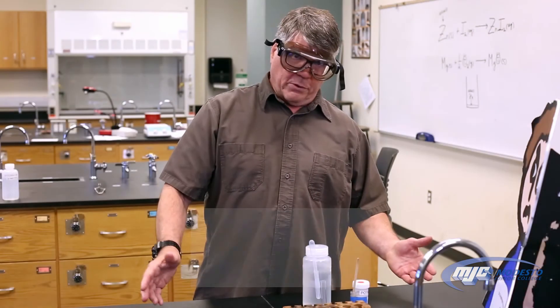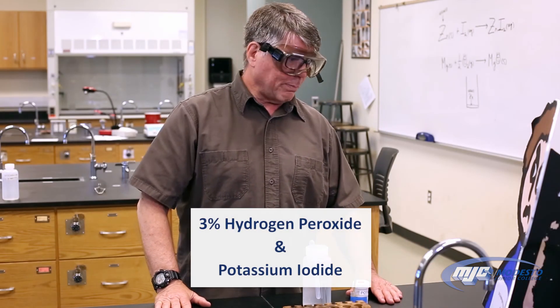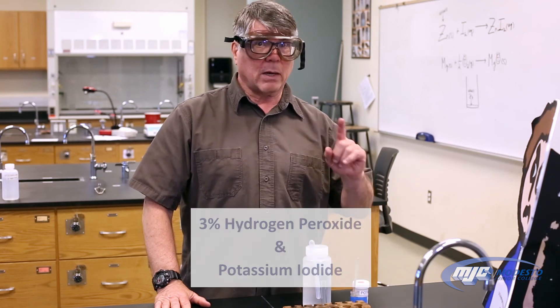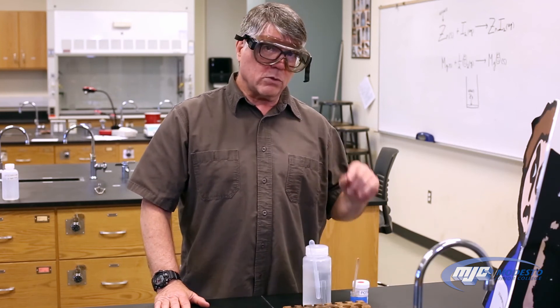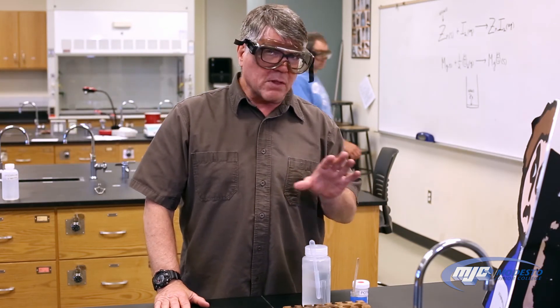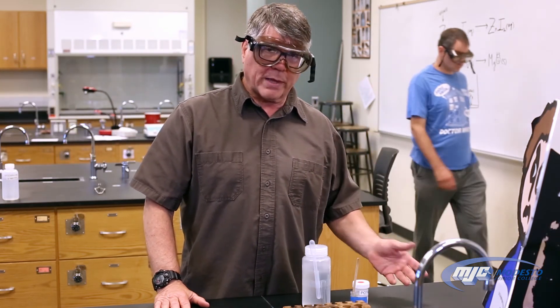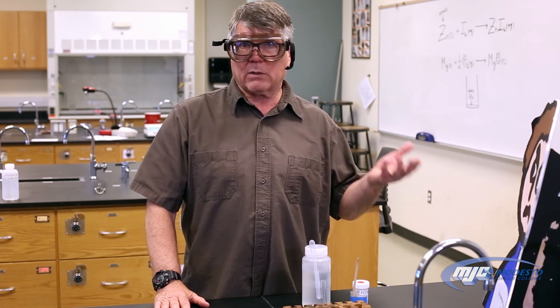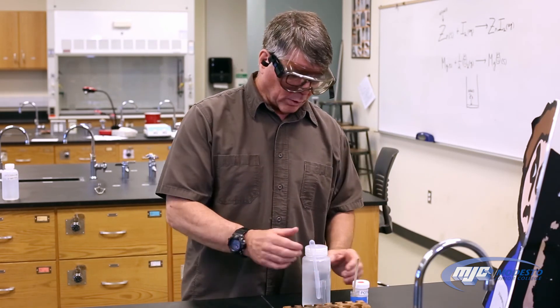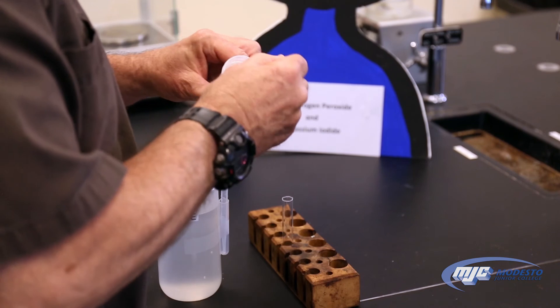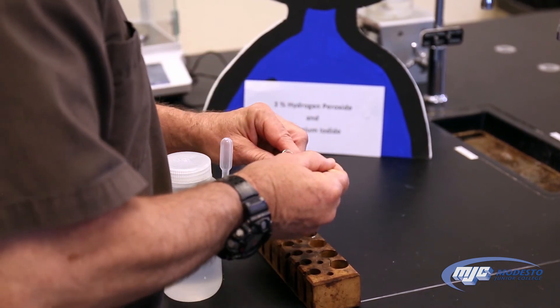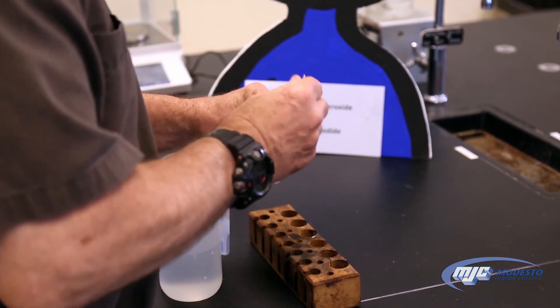This is the reaction, if any, between 3% hydrogen peroxide and potassium iodide. One quick word about this: you will see a color in the solution, but that is not what we're looking for — that's just what potassium iodide looks like whenever it's in any solution or water.